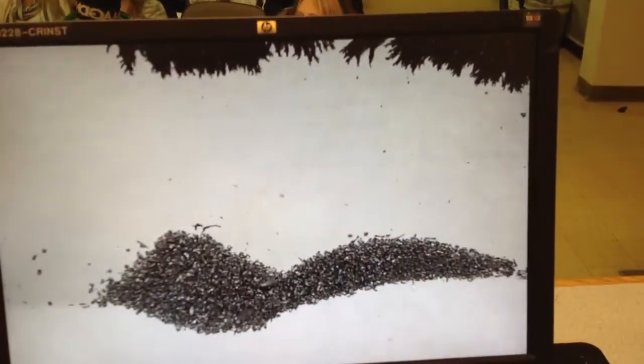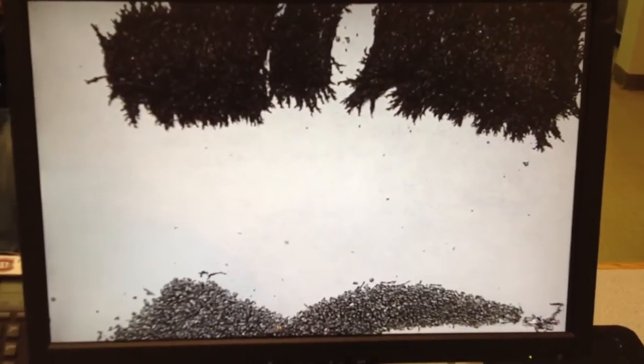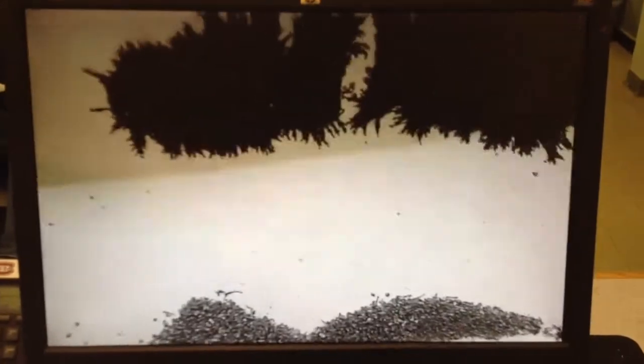Now again, it's probably not a perfect separation yet, but let's just do this one more time.